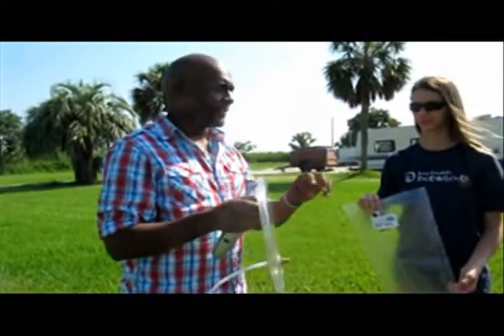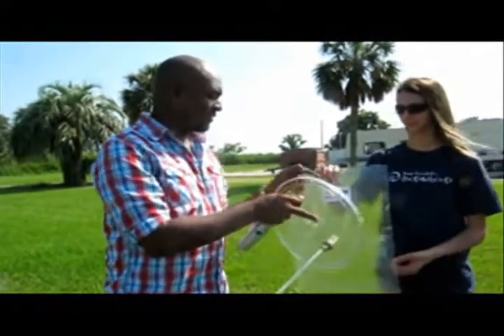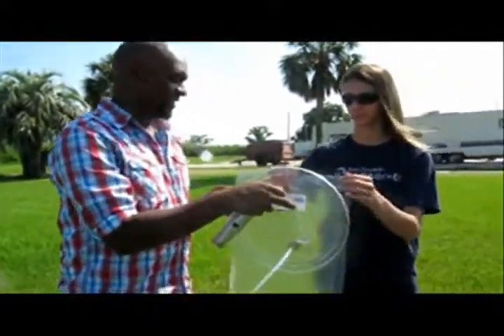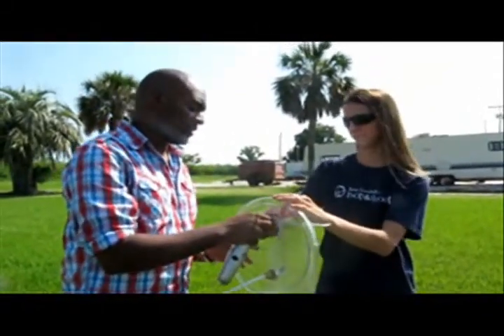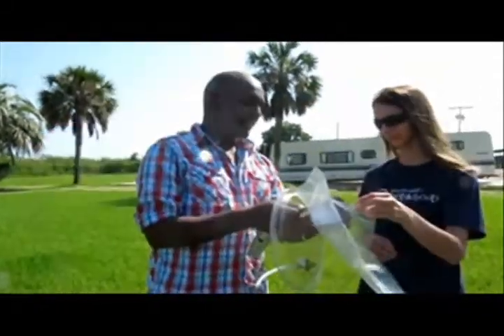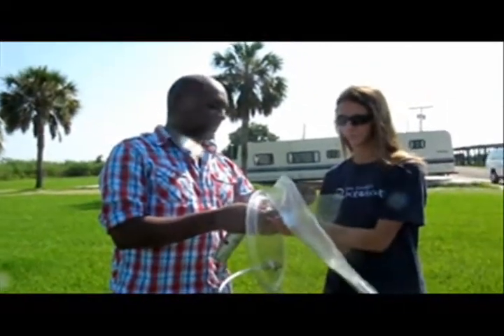The first rule is silver to silver. You're just going to screw this onto this. We're going to unscrew it and go so that about three of the threads are hanging out.